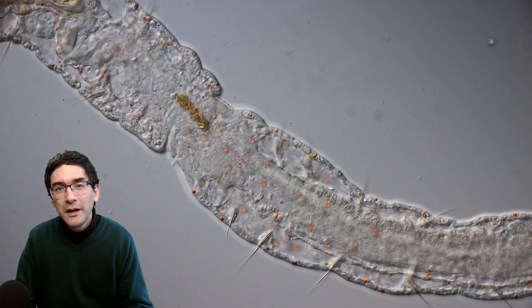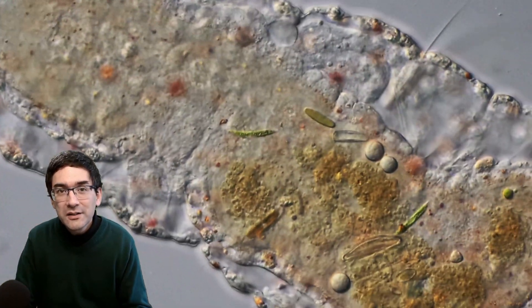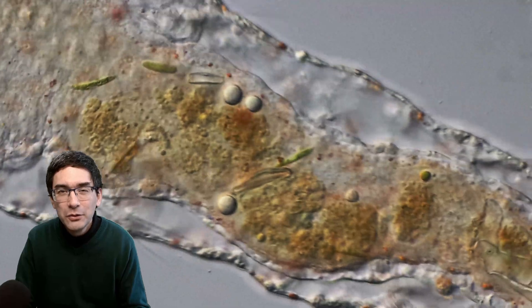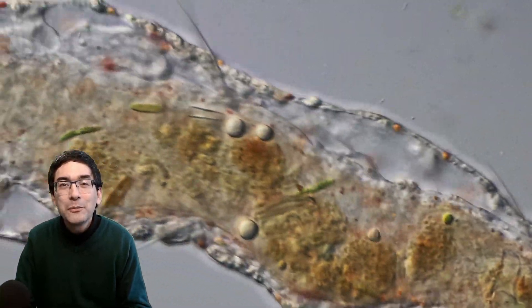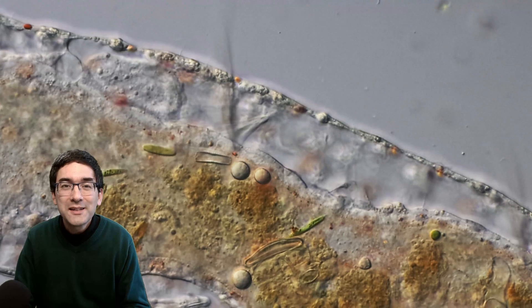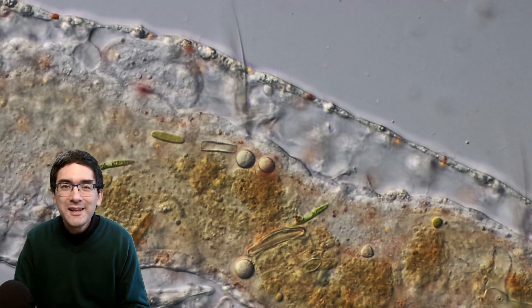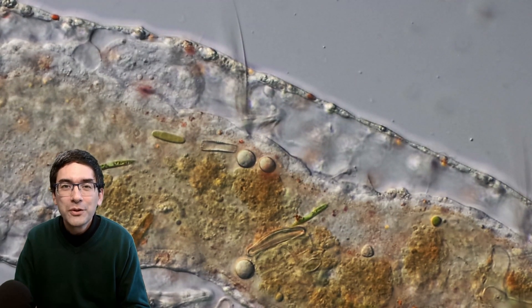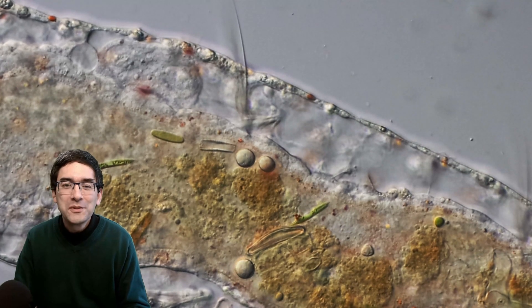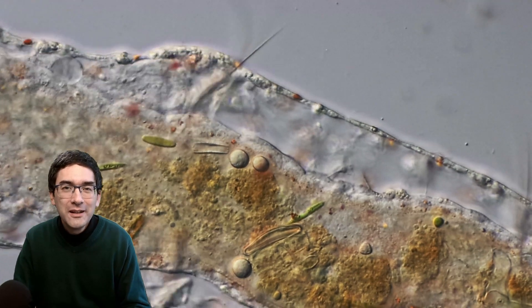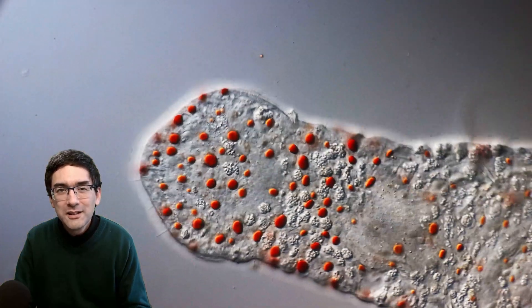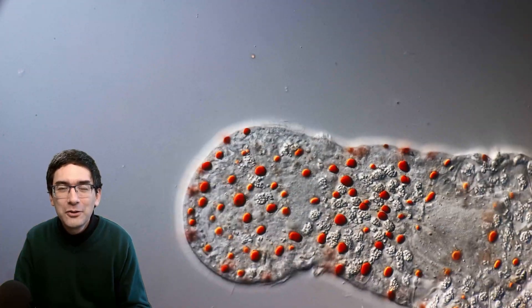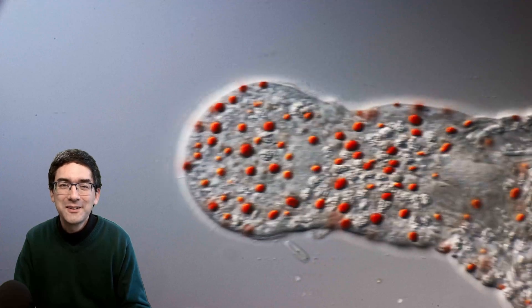You might also be able to find the stomach of this worm, and if you look into the stomach like I've done here, you might be able to see what it has eaten. In this case, this worm has devoured some diatoms—algae that it found in the water. It simply swallowed them up and now they've accumulated and built up inside the stomach.